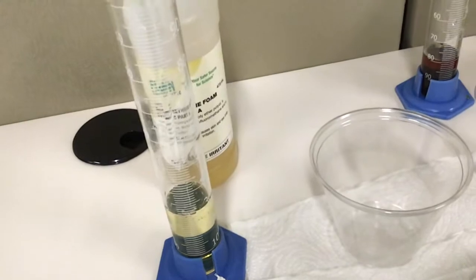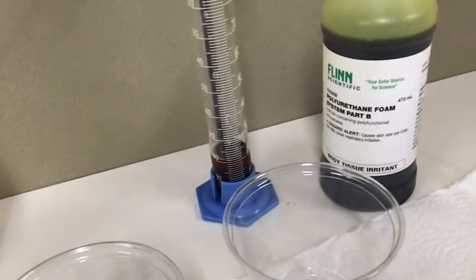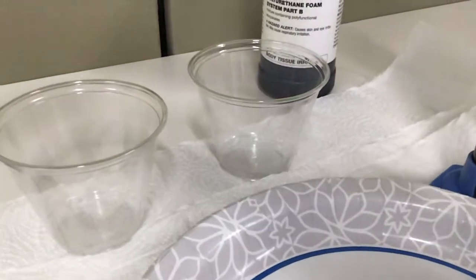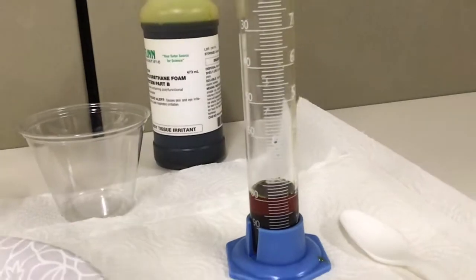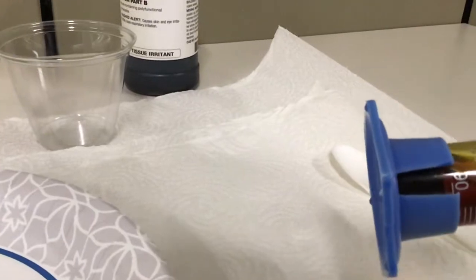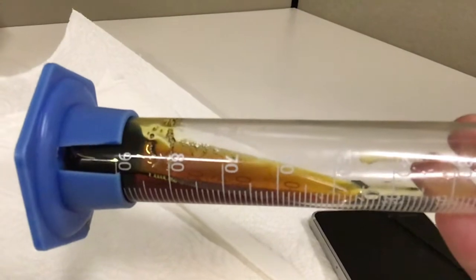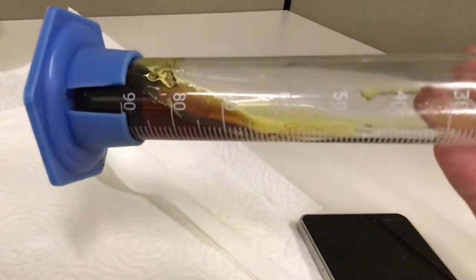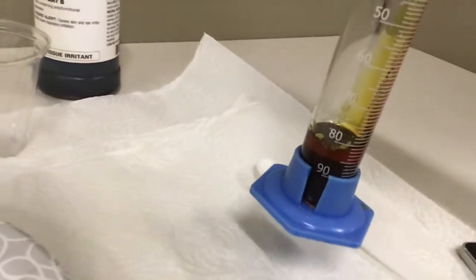Okay. And then here is cup B. Cup B, which I have not poured in yet, but let's take a look at this graduated cylinder. For this graduated cylinder, I have 20 mils. You're going to record 2 observations. And this is not as thick, I think, as the solution A, but it reminds me of maple syrup.